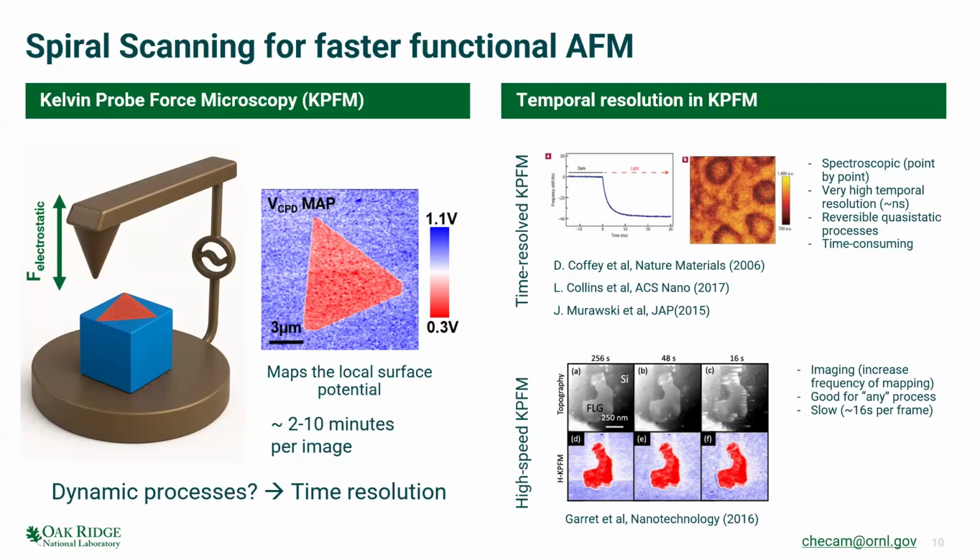Now, we've tried others that we also had and they didn't show that nice of a story. And I think it's because most of them don't have that hierarchy of the superlattice part of it. This superdomain structure is kind of a precondition to apply this technique. Can you say that again? I mean, is this A1, A2 superdomain structure a necessary condition to apply this technique?